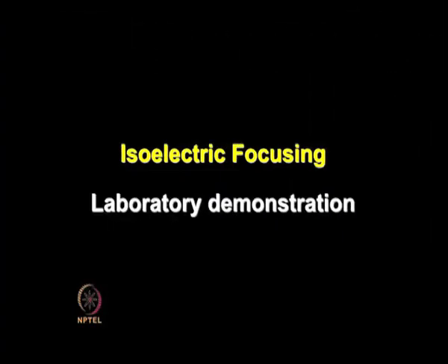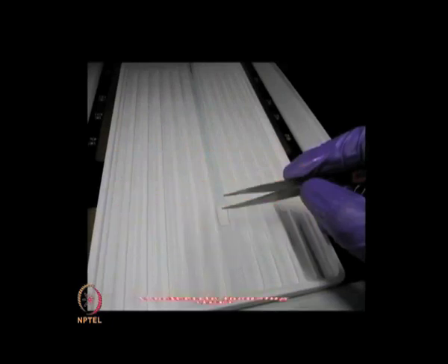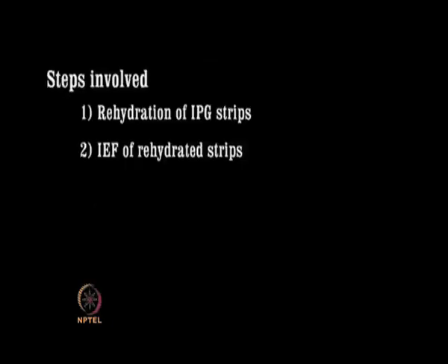So, I will give you the laboratory demonstration of isoelectric focusing, so that you can be very clear about different intricate steps involved in performing IEF. Isoelectric focusing. This process involves two major steps: rehydration of the IPG strips and focusing of the rehydrated strips.